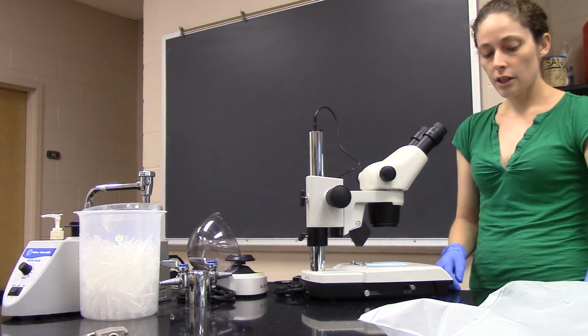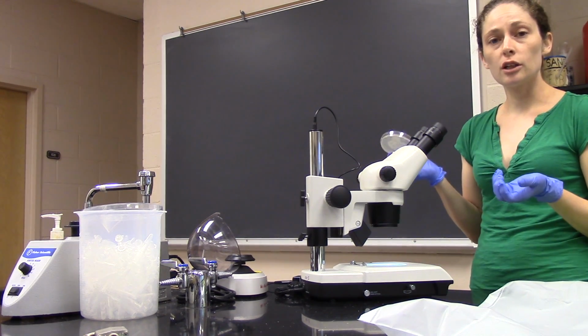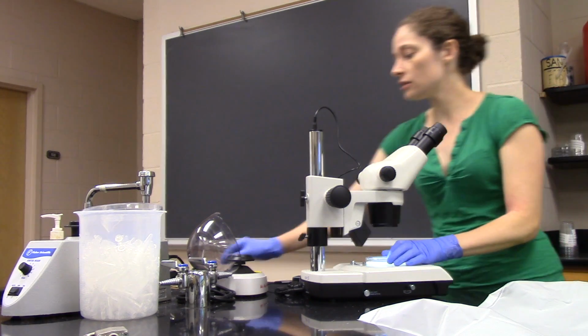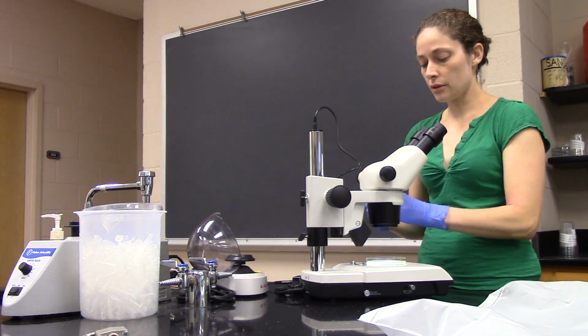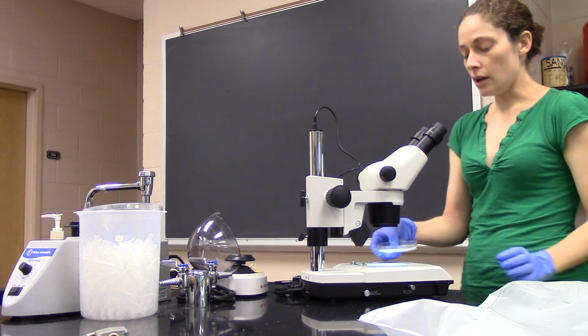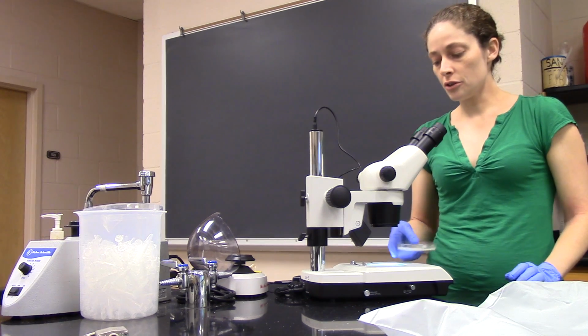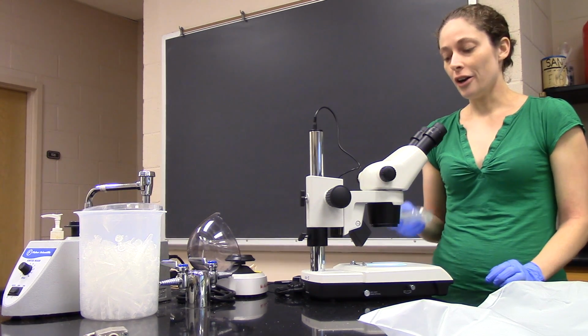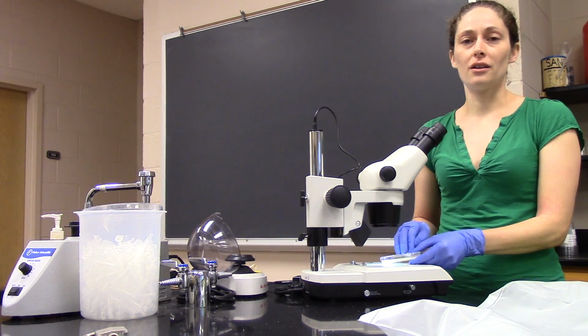All right, when you're ready to look at your sample, let's say we're going to look at a plate of worms here. You can place it on the microscope. If there's condensation on your plate, quickly grab the lid, wipe it off, place it back on. All right, now a very good idea is whenever you're trying to initially focus your microscope, you want to make sure that you are 100% looking at something, all right?